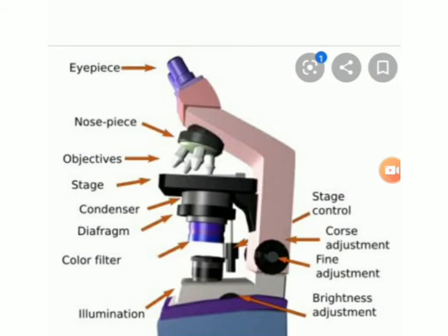With the stage adjustment knob, we can move the slide up and down and sideways, right and left.